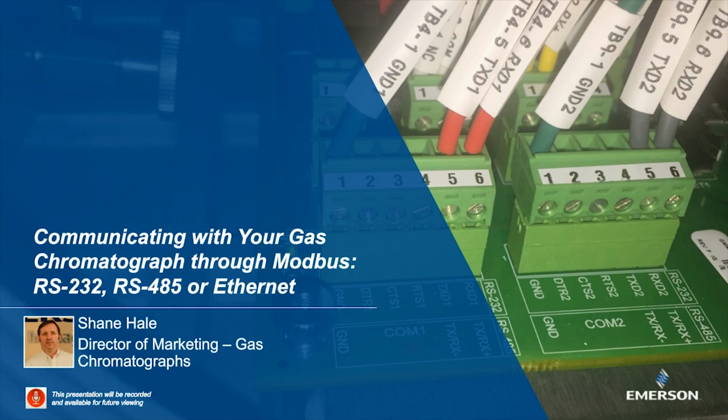We're going to be talking about communicating with your gas chromatograph using Modbus with RS-232, 485 and Ethernet. I do have a poll up at the moment, so while we wait to begin the main section of the presentation, if you can go to the poll and answer that question there. The main question I have there is, what's the main way you communicate to your GCs today? RS-232, 485, 422, Ethernet, wired or fiber optic, or foundation field bus?